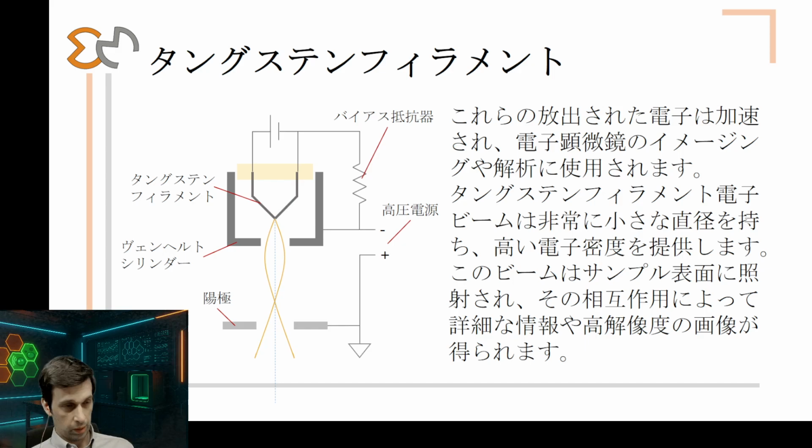This is why this kind of electron microscope is getting a little less common, and they are used as benchtop electron microscopes, not expensive electron microscopes, that you can use every day, and you can substitute the filament very easily.